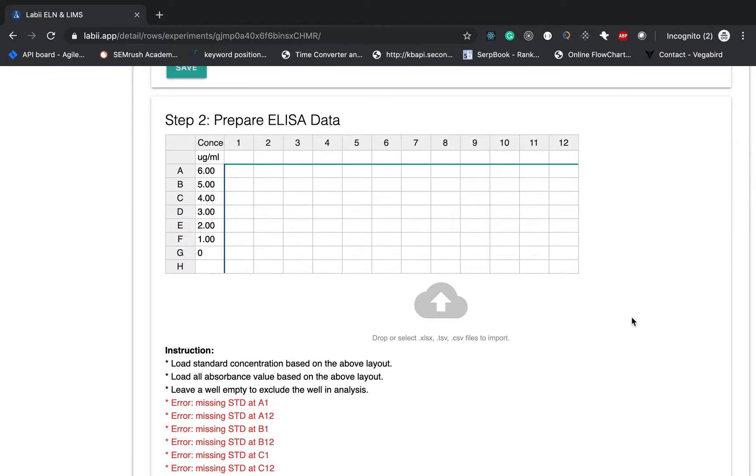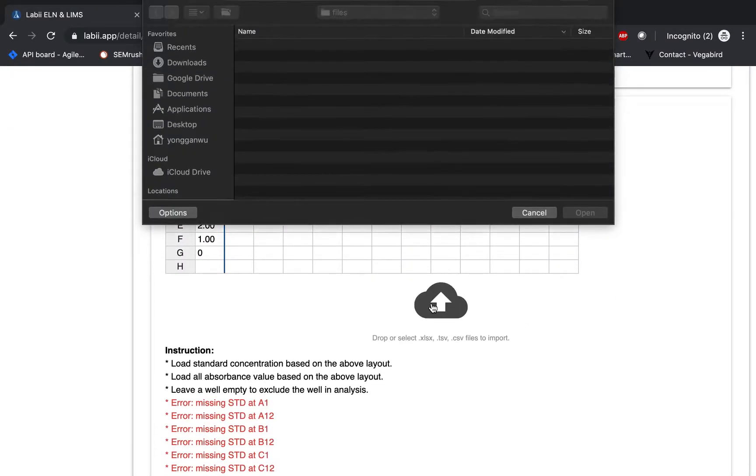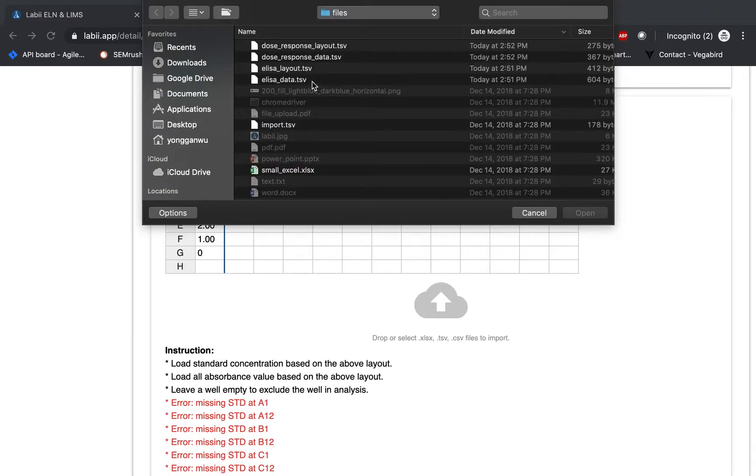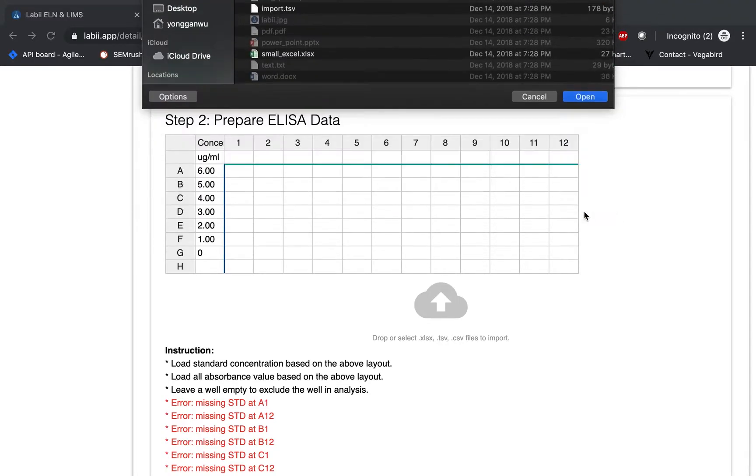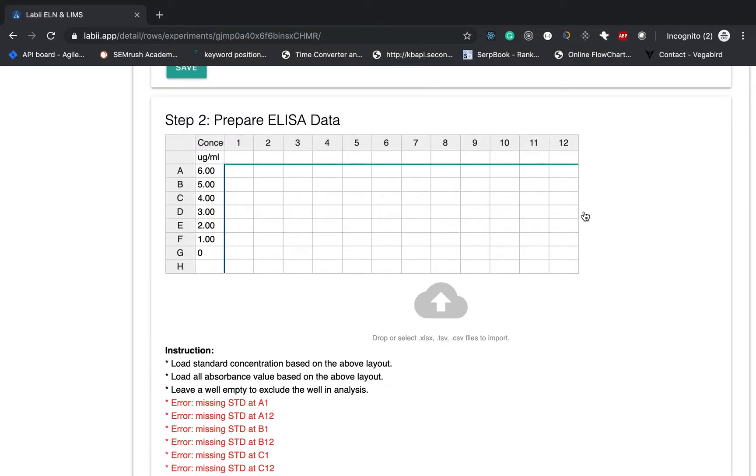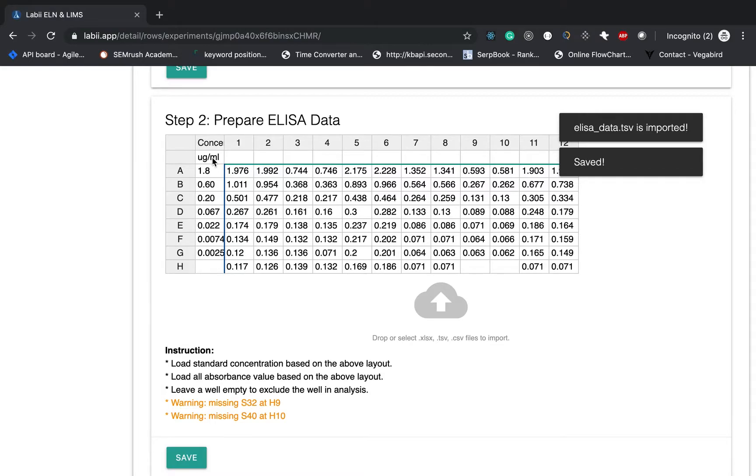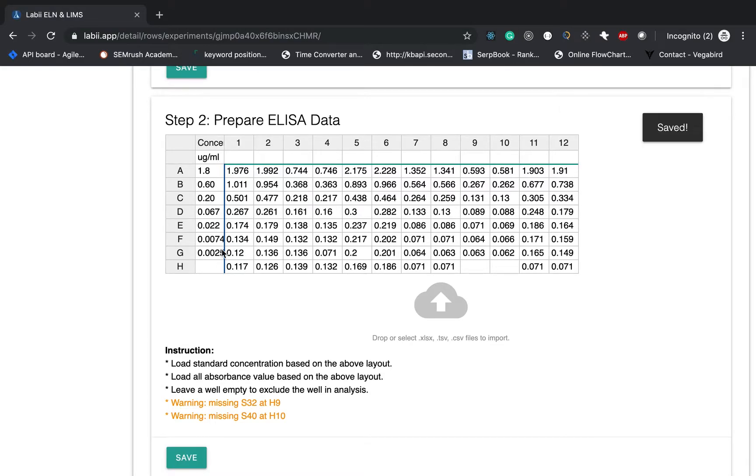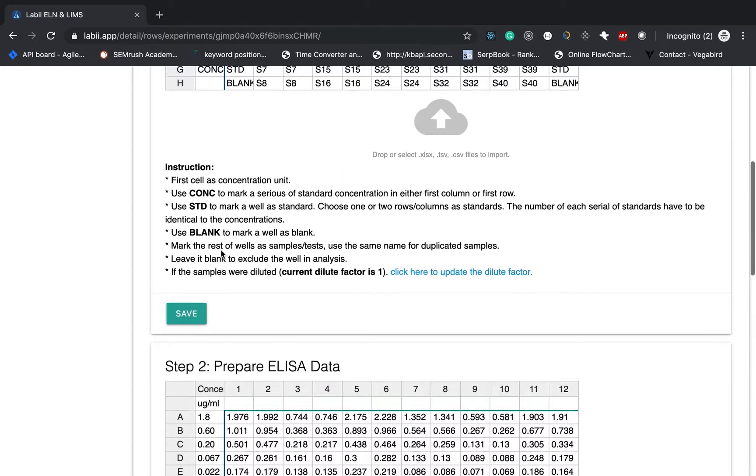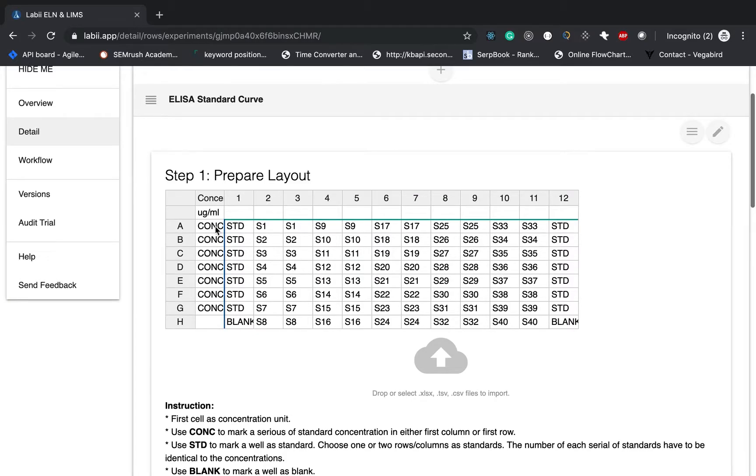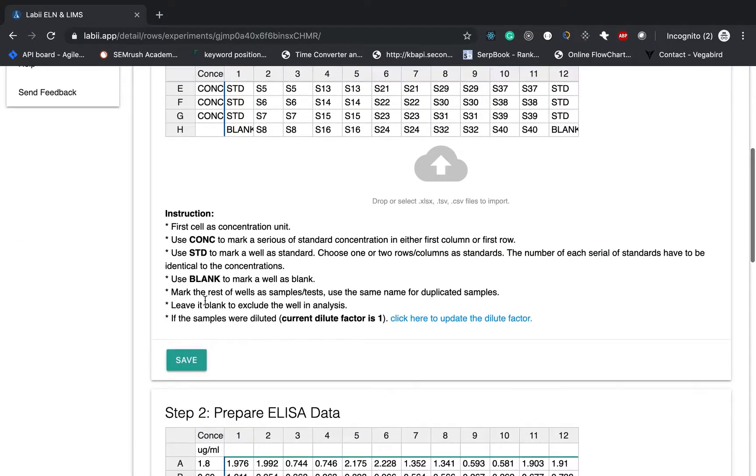Coming back to the ELISA data. You can do the same. Choosing the ELISA data. All the data will be imported and saved. Just noted the first column is the concentration of your standard. And you have to match the concentration listed over here.